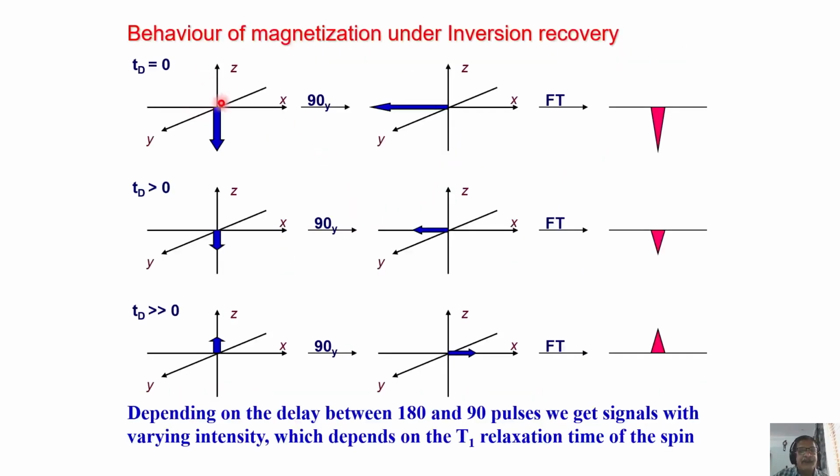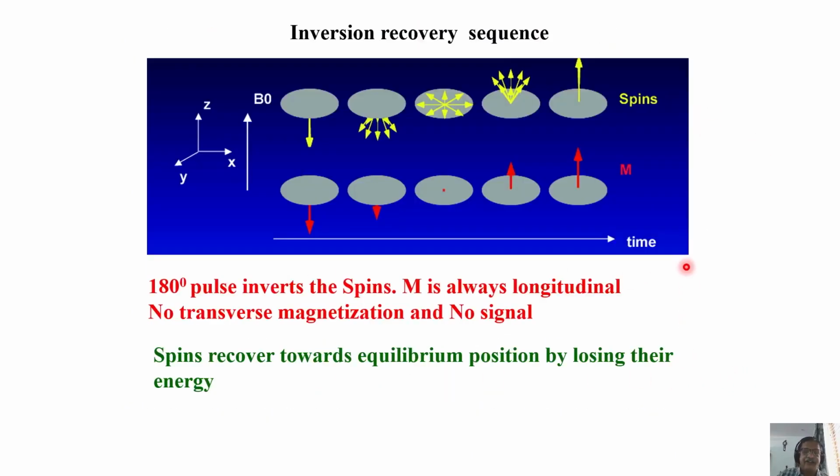Like a simple thing. First you bring the magnetization to minus z, the signal is negative, slowly keeps reducing and then keeps going along the z axis. This is the inversion recovery sequence. First, magnetization is brought to the negative axis, phase decoherence takes place, magnetization intensity comes down, becomes zero. This is called the null method.